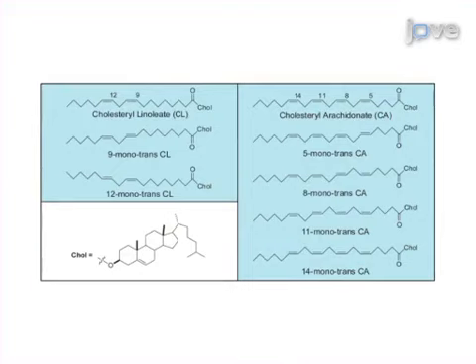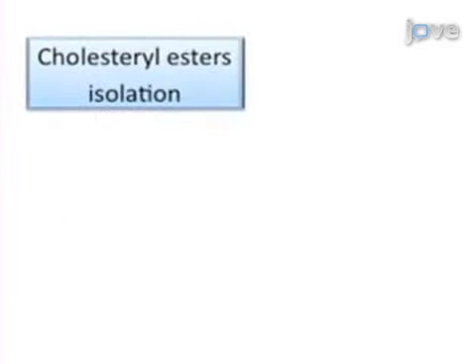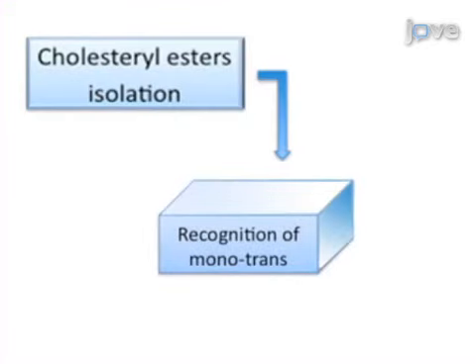The synthetic plan can also be designed to simulate free radical processes occurring in a biological environment, which is the principle of biomimetic radical chemistry. As a second step, the products are purified, analyzed, and characterized, which provides structural and chemical information of the modified biomolecules in order to organize molecular libraries and facilitate recognition in the complexity of a biological environment.